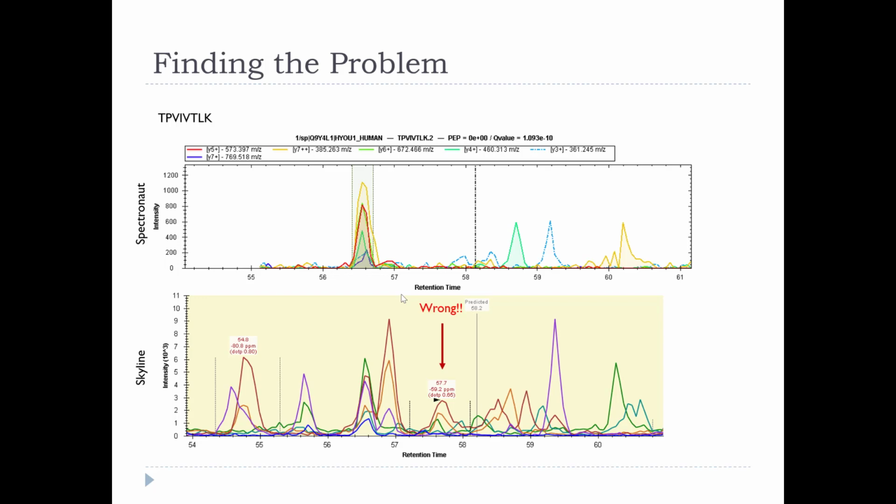So in this case, again, I looked at chromatograms, and happily both Spectronaut and Skyline make it pretty easy to look at chromatograms. I took something where Skyline and Spectronaut had wildly different opinions of how good the peak was. Skyline was picking this, and Spectronaut was picking this, which is pretty good, but clearly Skyline's just not really picking that up because of the interference next to it. And I was like, oh, why is this so much dirtier than this?